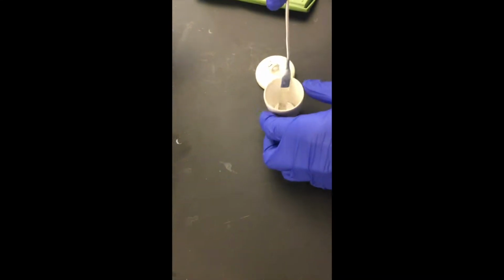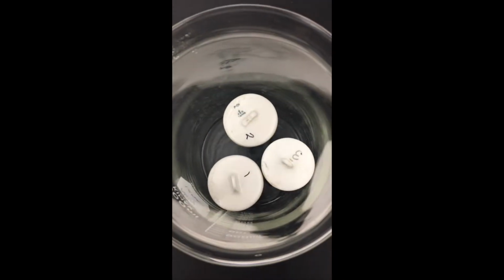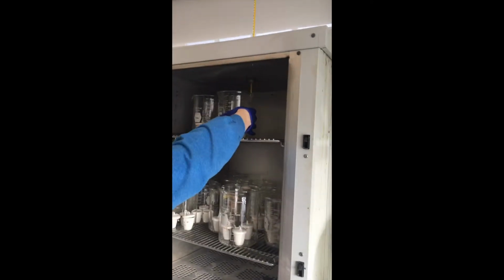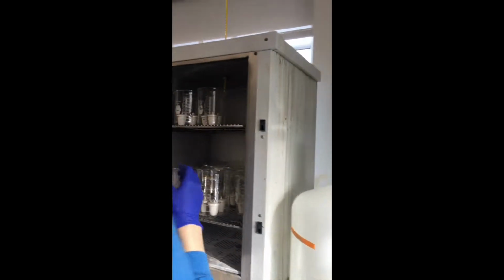To begin the lab, you're going to obtain 3 Walter crucibles and fit each with a piece of filter paper inside. You're going to label each crucible with Sharpie and not label tape. Next, you're going to put your labeled crucibles in the oven at 105 degrees Celsius for about an hour.